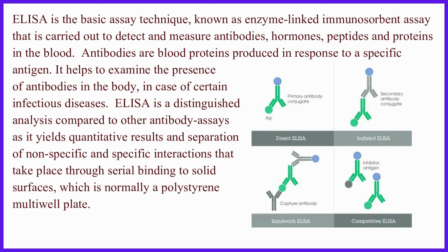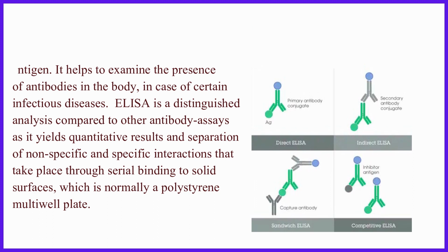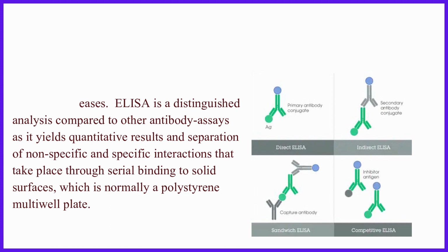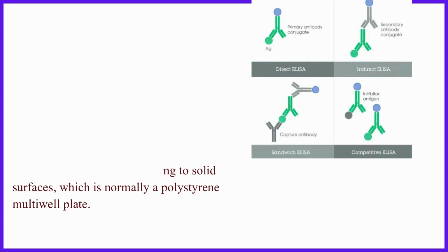ELISA is a distinguished analysis compared to other antibody assays, as it yields quantitative results and separation of nonspecific and specific interactions that take place through serial binding to solid surfaces, which is normally a polystyrene multiwell plate.